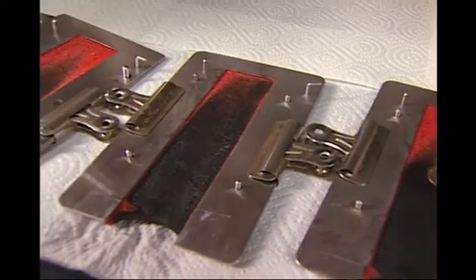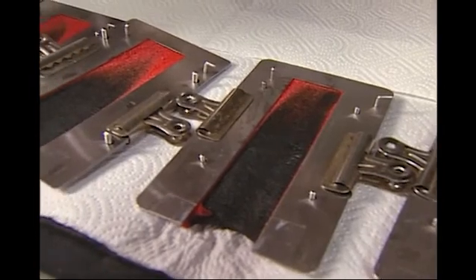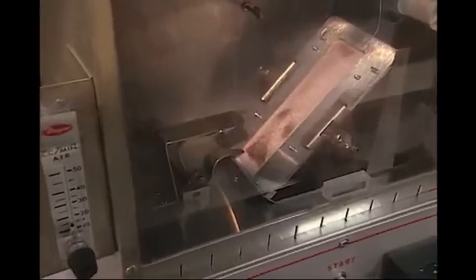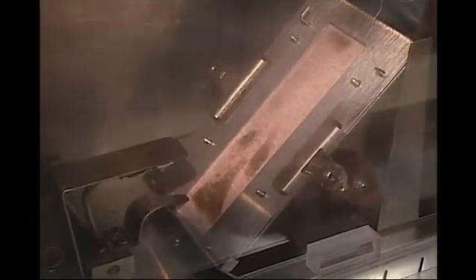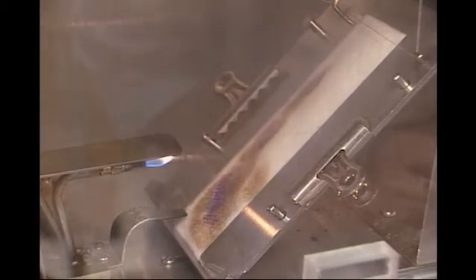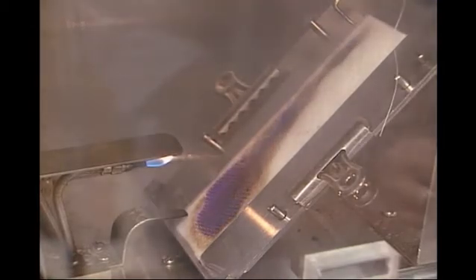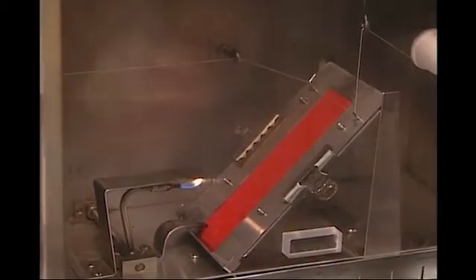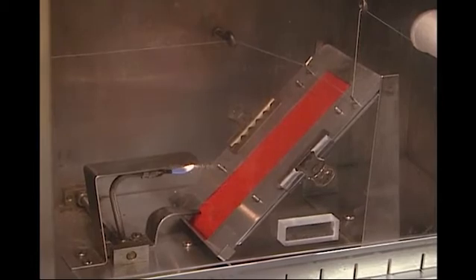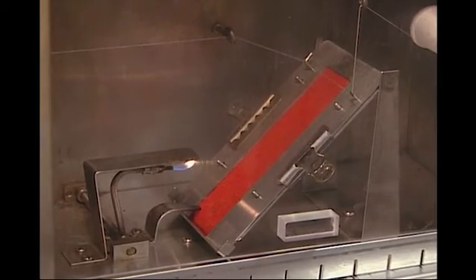The preliminary classification is based on the average burn time of the five specimens tested. Sometimes specimens will exhibit a surface flash that may or may not burn through the thread. Some fabrics may or may not burn through their structure. When fabrics burn through their structure during this test, it is called a base burn. The criteria for classification of burning behavior combine the average burn time and other observations of burning characteristics.